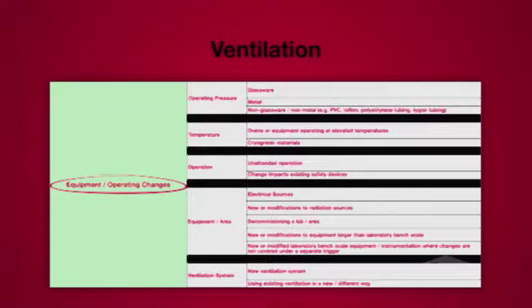Finally, ventilation is included in this section. This gives you the opportunity to consider the impact of altering a hood or other ventilation device in your procedure. If the airflow is altered in any way, even just turning off a hood, the air balance can be greatly affected, potentially increasing the risk of exposure.